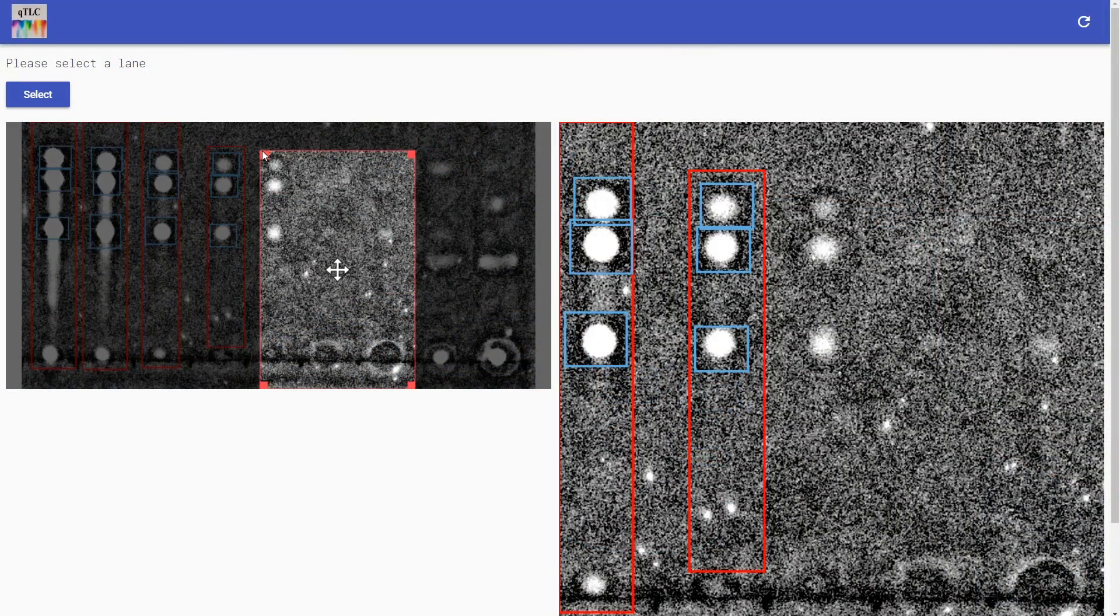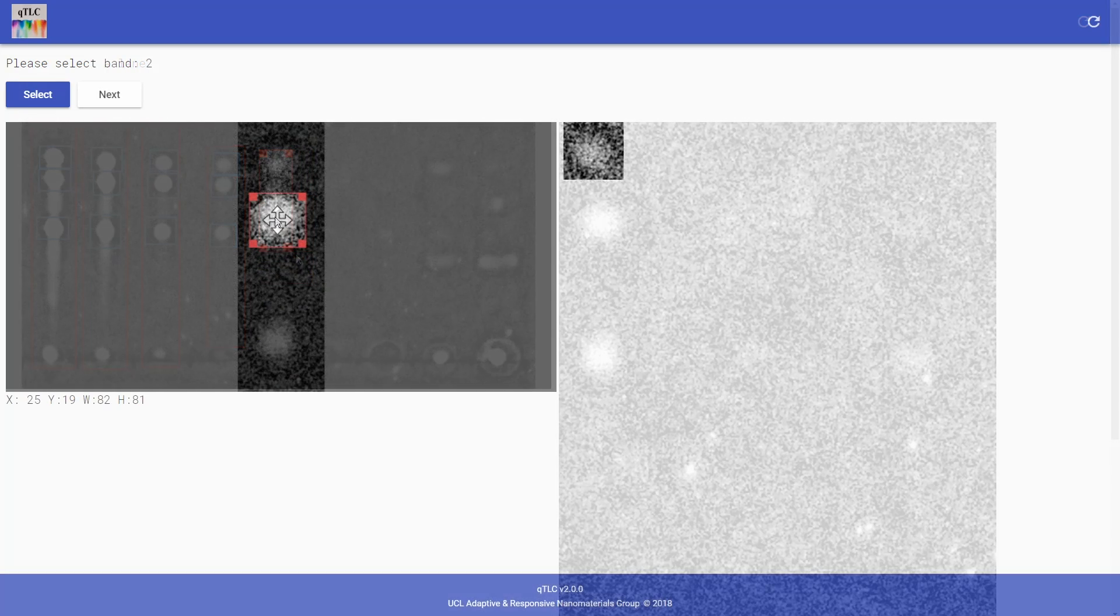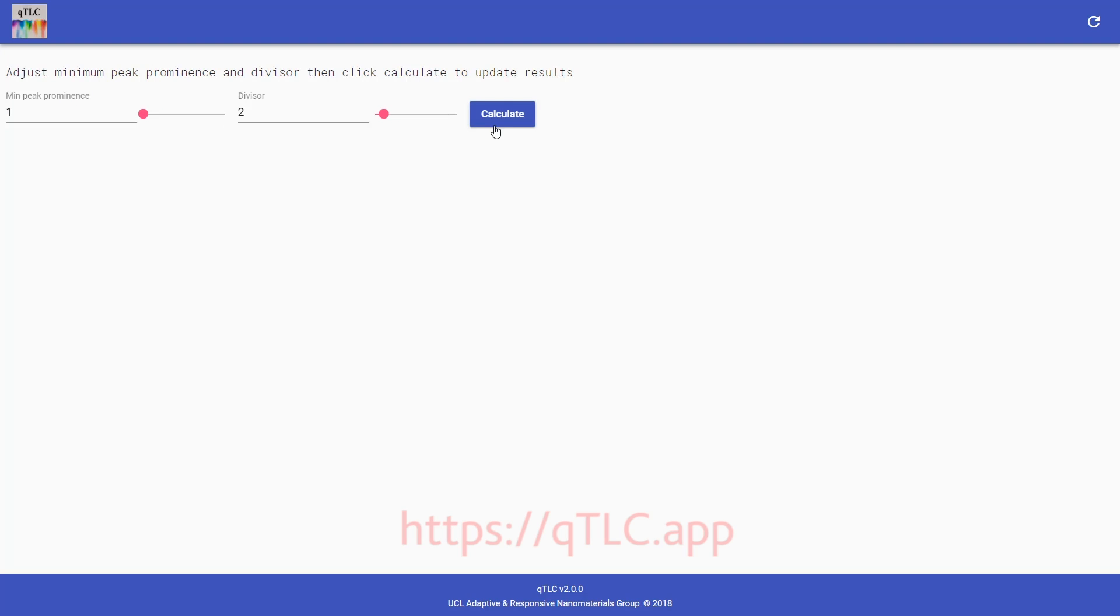Inside the web app you can define which molecular bands you are interested in. The web app then computes the relative number of molecules within each band based upon their shape and intensity.